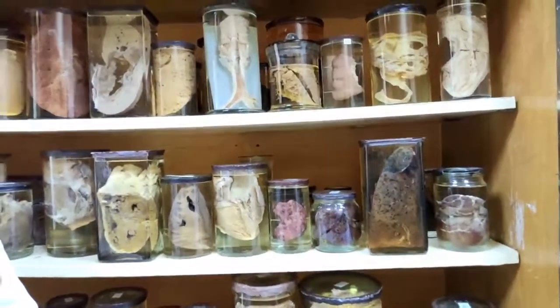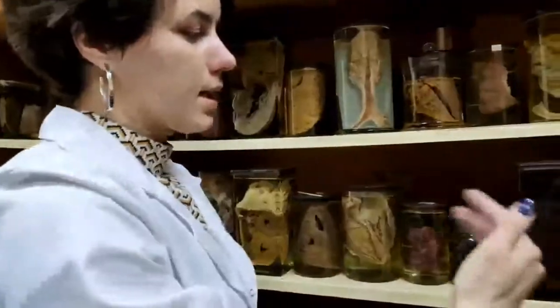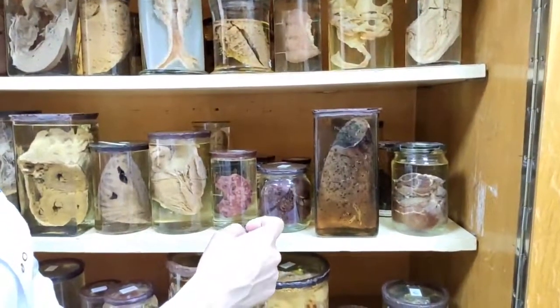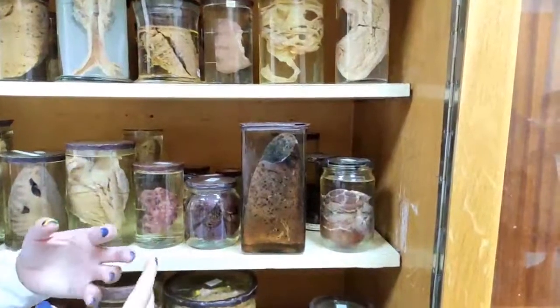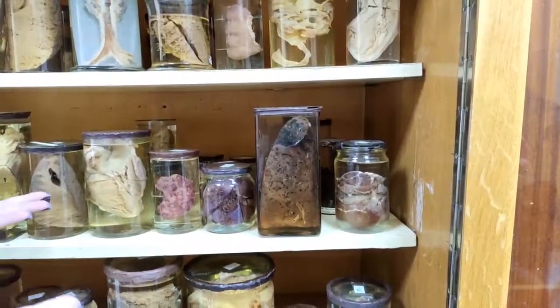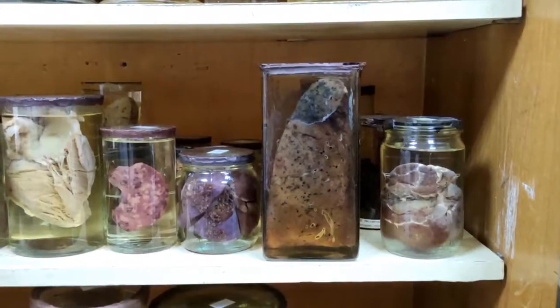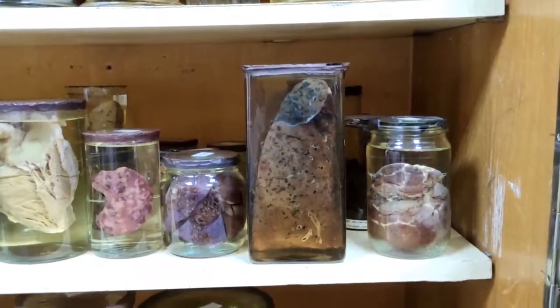The next step will be so-called red hepatization, because a lot of erythrocytes will be in the alveoli. On the next step, it will be yellow hepatization, and here we can see yellow hepatization when neutrophils come into the alveoli and eat all the erythrocytes. And the last step will be healing, or recovery of the patient, when all this exudate just disappears.